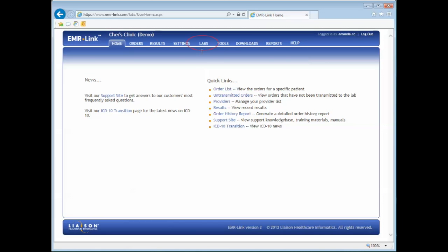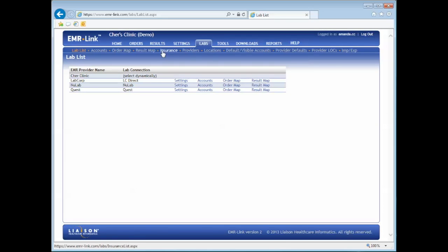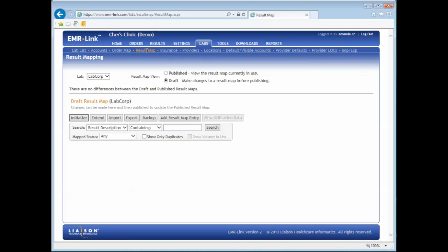Click on the Labs tab, then choose Result Map. In the Lab drop down, choose the lab you wish to edit.